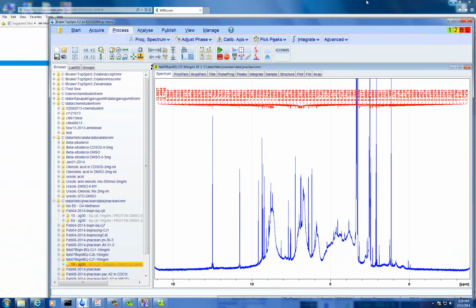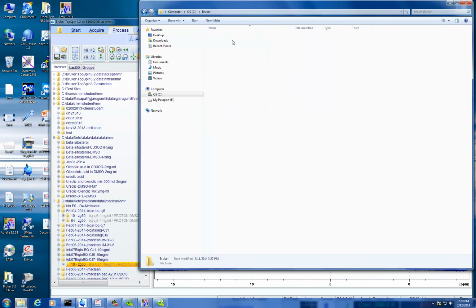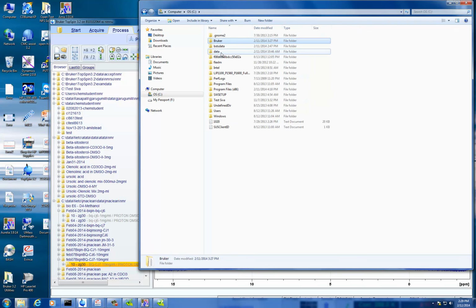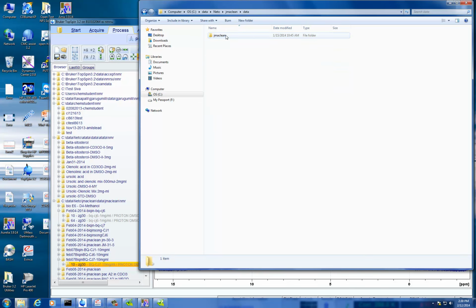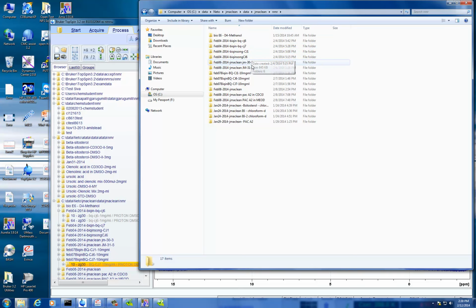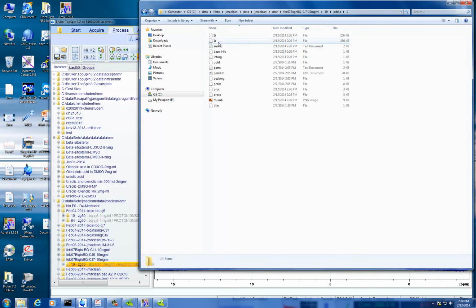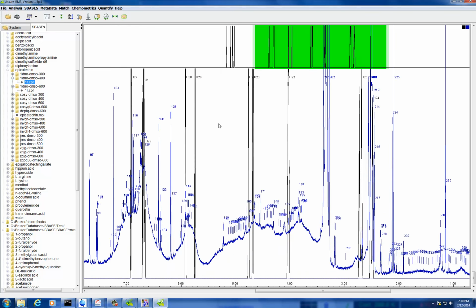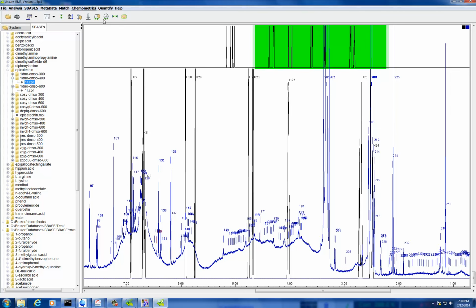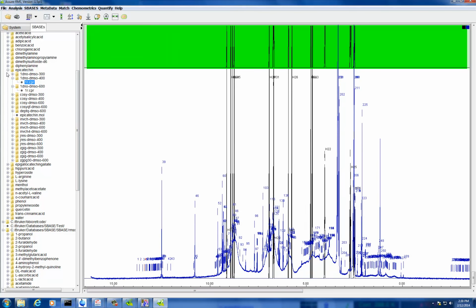Okay, so let me just find this folder. C data, and 10 micro. Yeah, it's that one. See how many you can put in there. Out of these, do you want me to try and put them all? If you can. That's the entire spectrum, right? Yeah, that's your spectrum. Just drag it inside, and now you can pull in compounds and see.